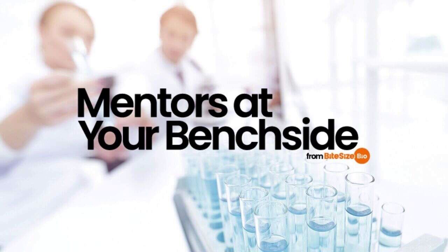Problem number 6. The stain is stronger in some lanes and weaker in others. This is not necessarily a problem with your technique, but shows a different amount of protein between lanes. If you need even protein concentration across lanes, try a Bradford or BCA assay before loading your samples to determine the exact quantities to load. The amount of protein added is more important than the volume of the solution here. But you need to keep in mind the dilution of your loading buffer, and add the appropriate amount.